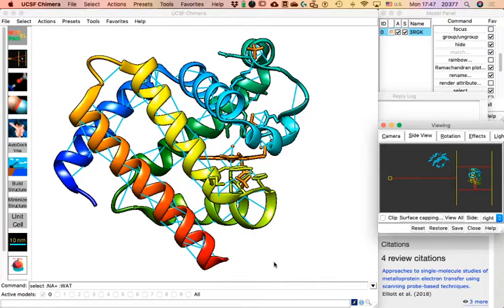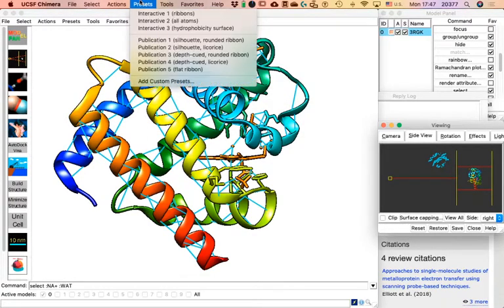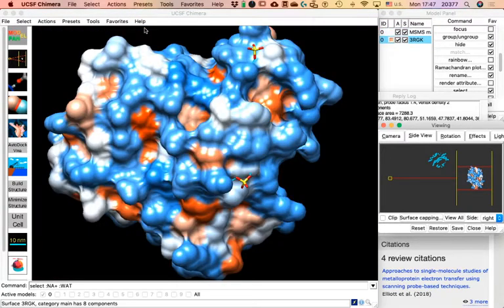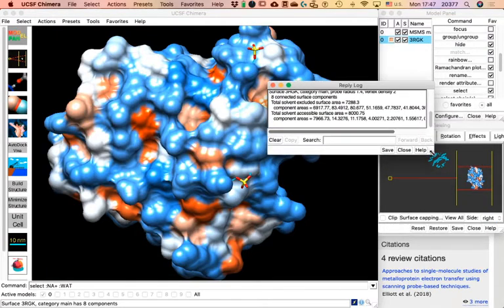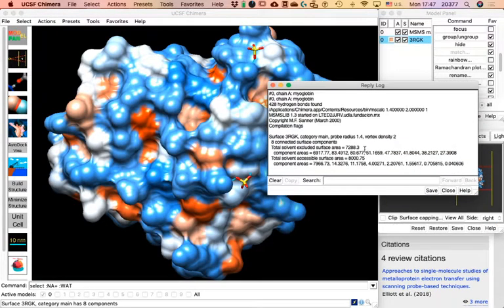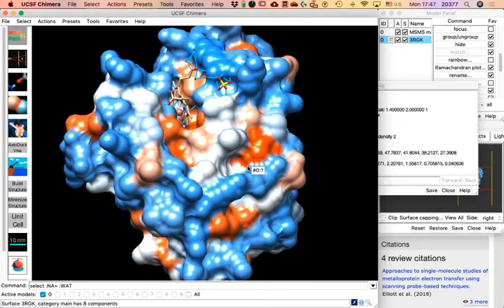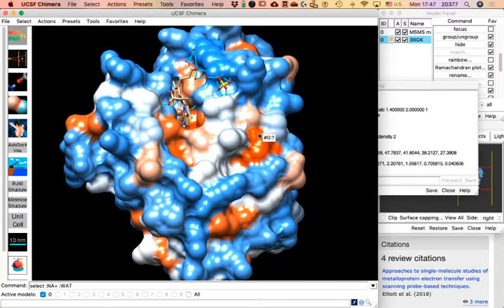In Presets there is a preset for 'Hydrophobicity Surface.' If you click on that, the program will calculate the surface of the structure. We can see a lot of data for that calculation, and the display now shows us the structure as if we were looking at the surface — not the atoms that make it up, but the surface itself.